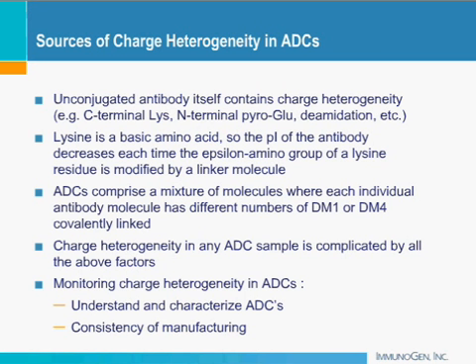Now, traditionally, we know that ion exchange, slab gel IEF, and capillary isoelectric focusing have been used to look at charge heterogeneity in proteins, but each of these comes with some limitations when you compare them to ICIEF. The main ones being, in general, the resolution is poor. There's always difficulty in quantifying the protein, and some of these methods are also very time-consuming and labor-intensive. And I will go through some examples of these methods.